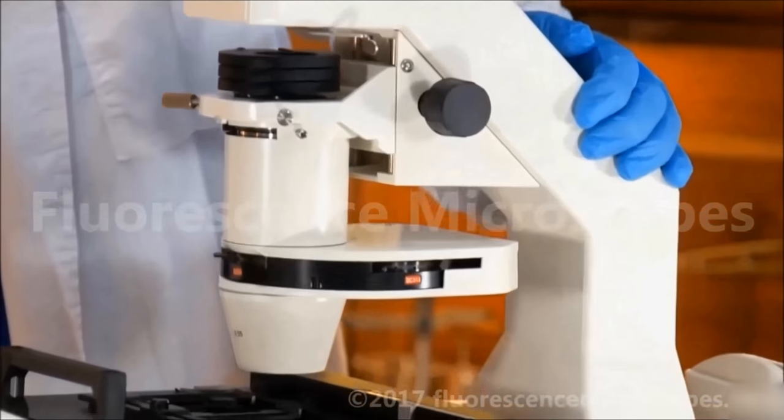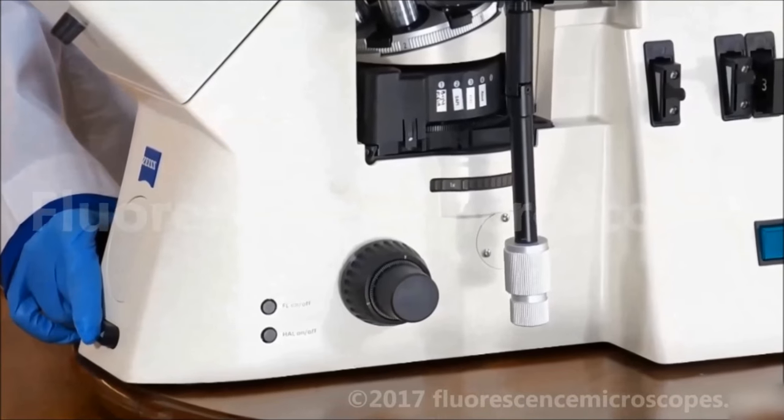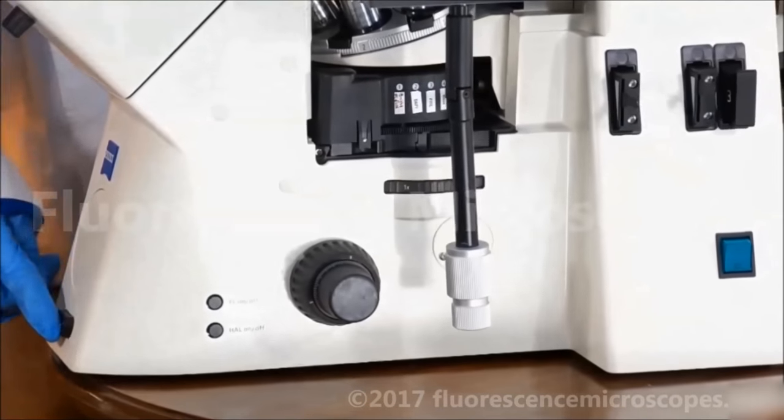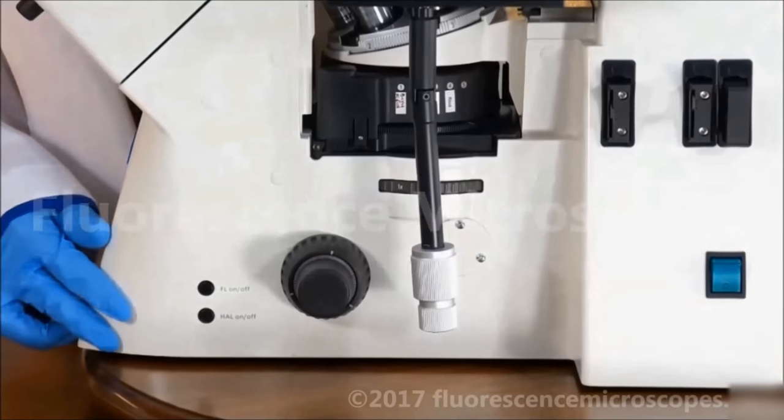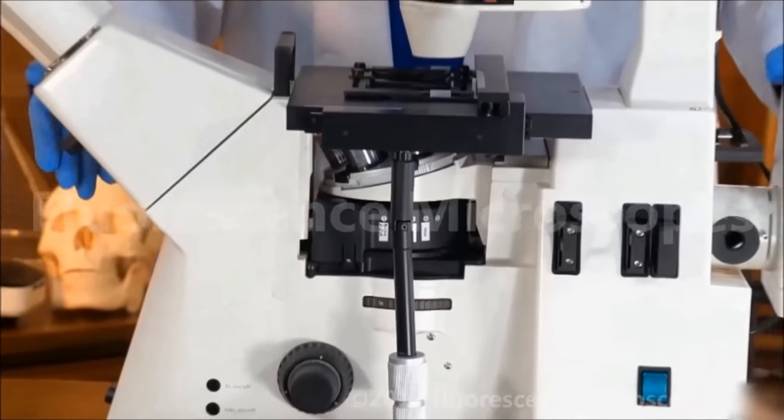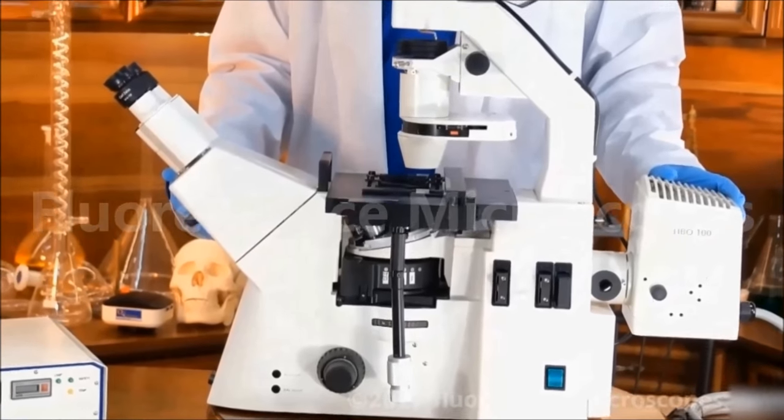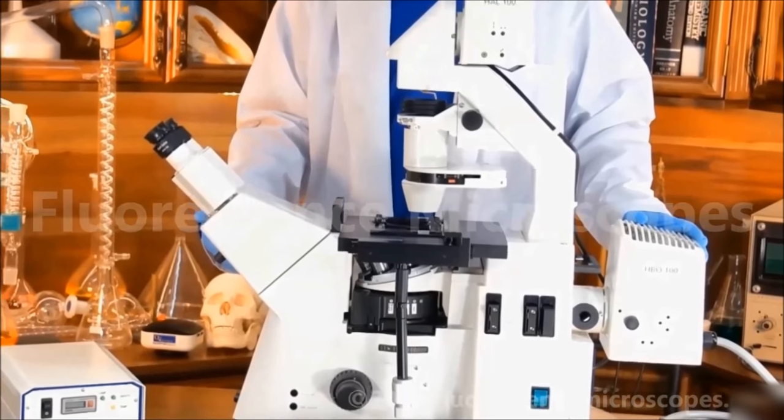This is the transmitted illumination in variable intensity. If you have any questions about this microscope or you need any specific configuration, please let us know. We'd be happy to configure it however you may need.